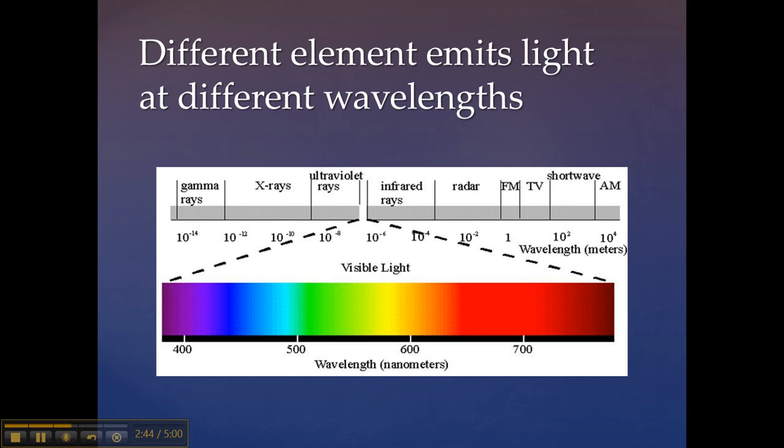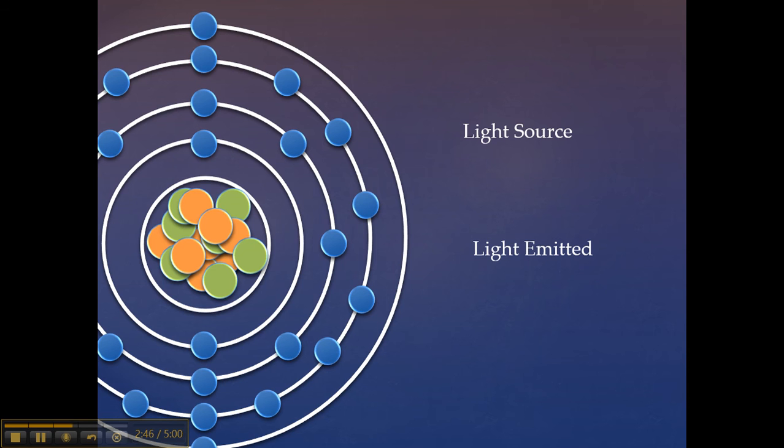Because electrons like to have as little energy as possible, the excited electrons will eventually relax down to their ground state in a process called emission. When the electron drops back down to the lower energy level, it will release the energy it absorbed in the form of light. Emission is useful because during our tests, if we see light at the wavelength that excited iron electrons emit when relaxing, then we know that iron is present in our sample.